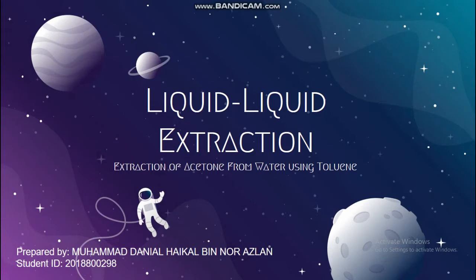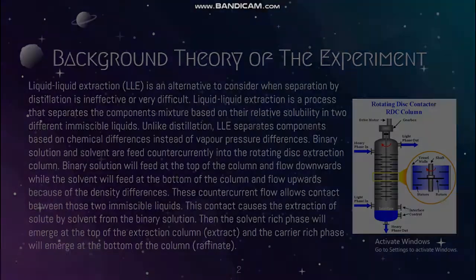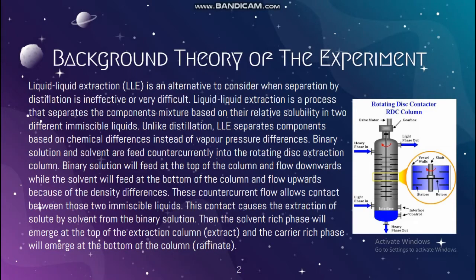So right now, I'm gonna present the pre-lab for liquid extraction, which is extraction of acetone from water using toluene. First, the background theory of the experiment.